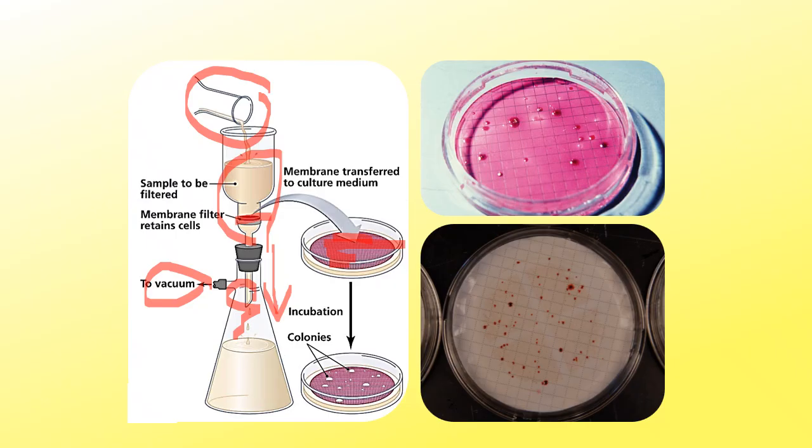After that, we put the filter on the agar media and incubate for 18 to 24 hours. After the 18 to 24 hours of incubation, you should get something like this. All these red dots are the bacterial colonies.